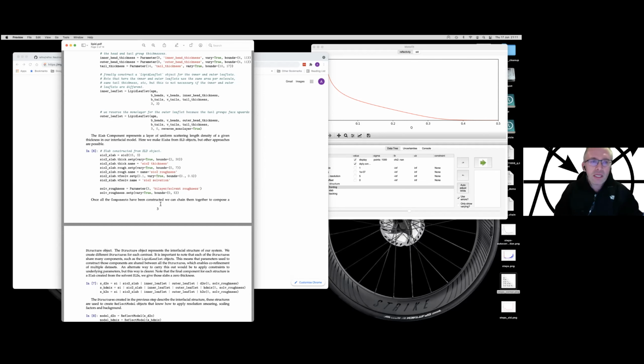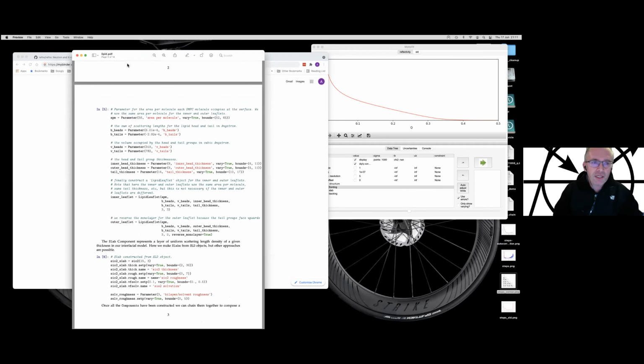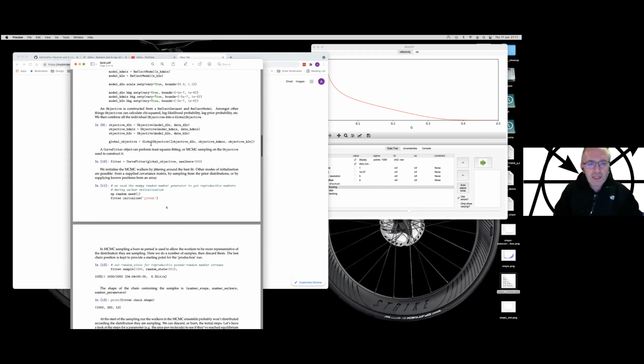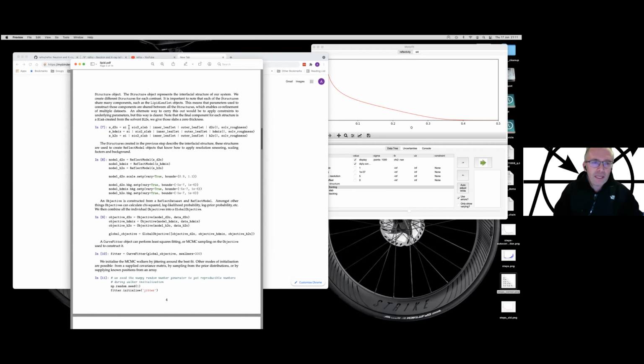What I'm showing you in this window is analysis that we did for the RefNX paper on a lipid system. Here we're making a structure composed of silicon dioxide, two leaflets of a lipid bilayer, followed by the solvent. And you see here, we're reusing the solvent roughness parameter.